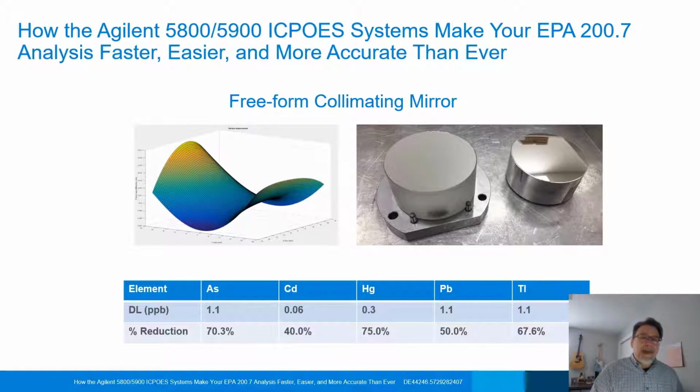So this has made a tremendous difference in the numbers that you're going to get for your low-level metals, especially the difficult metals that you see in environmental analysis, and in the reliability of the data, especially down low, when you're having to run at your CRI or at the very, very low level at reporting limit. This makes those numbers much more reliable. Granted, it's going to push reporting limits down probably, but that's the business we're all in, right? The instrument can do something cool and new, and people start taking advantage of it, and then we all have to live up to that for the next 10 years until it all pushes down again by a factor of 10.